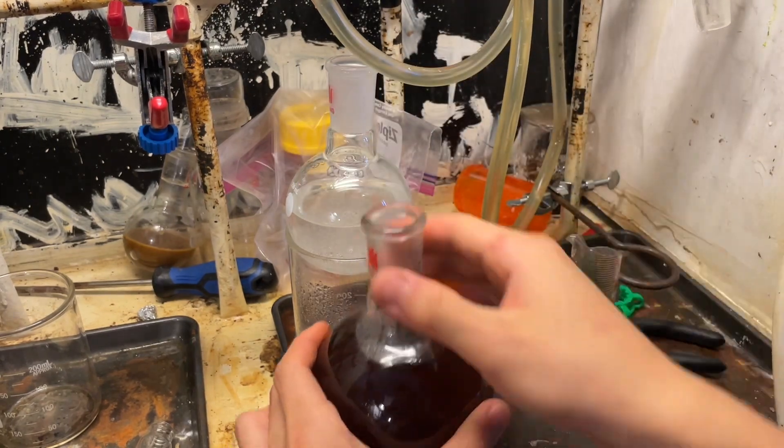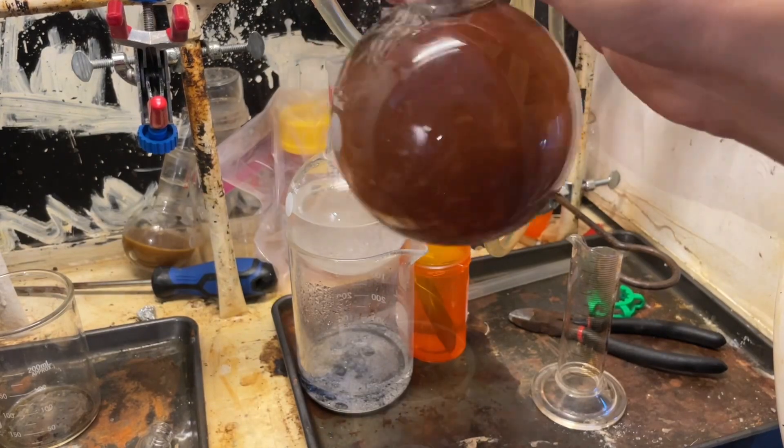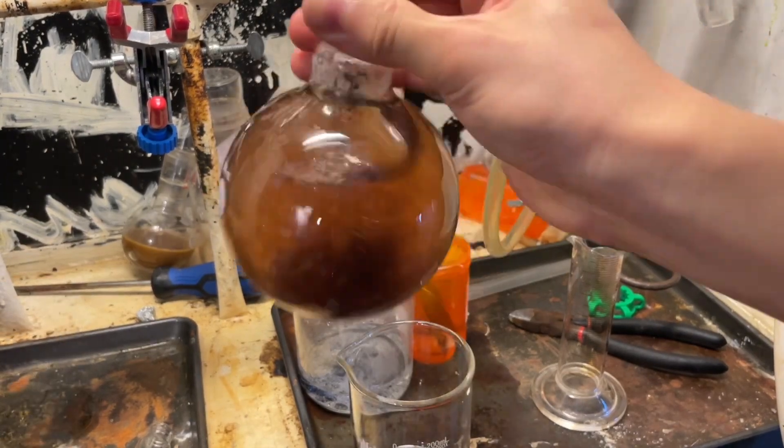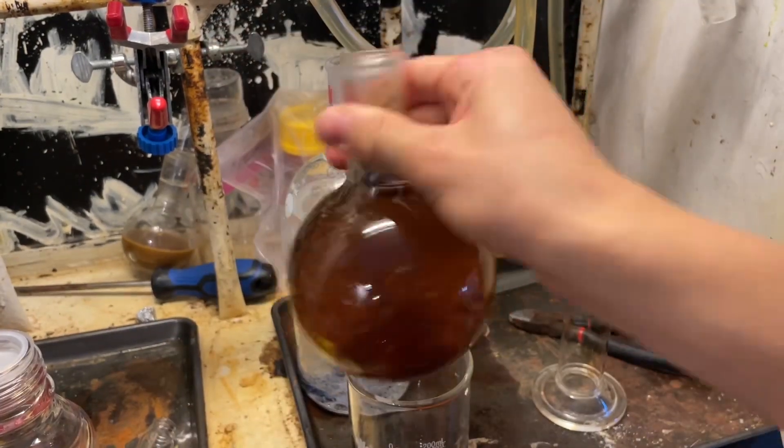and we're going to combine it with our distillate to convert any free amines — such as quinoline or aniline — into their sulfate salts. And this will be for our upcoming step, which is diazotization.